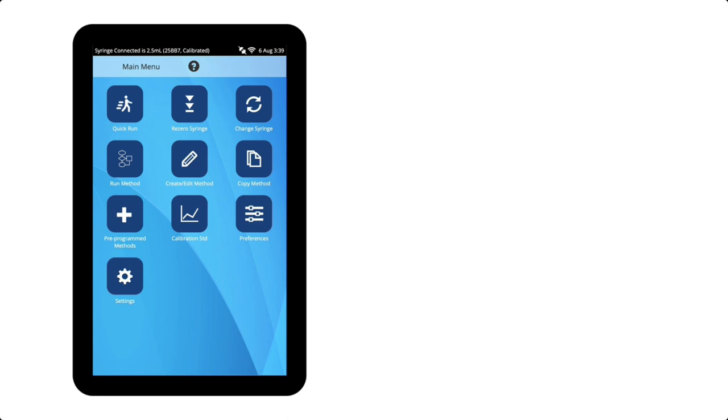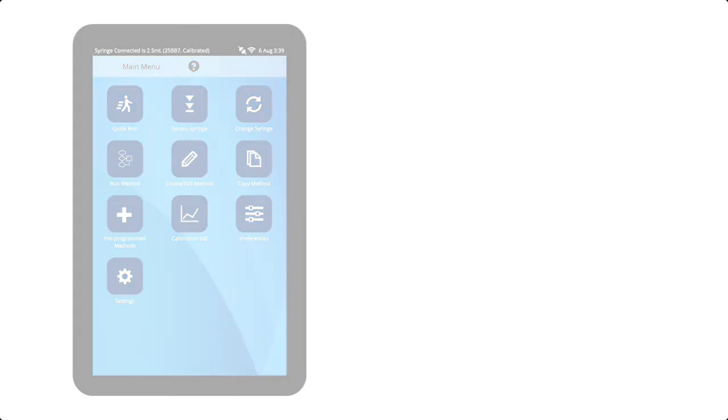I hope this short video has shown you how to create a calibrated syringe with the Digivol software. Bye for now.